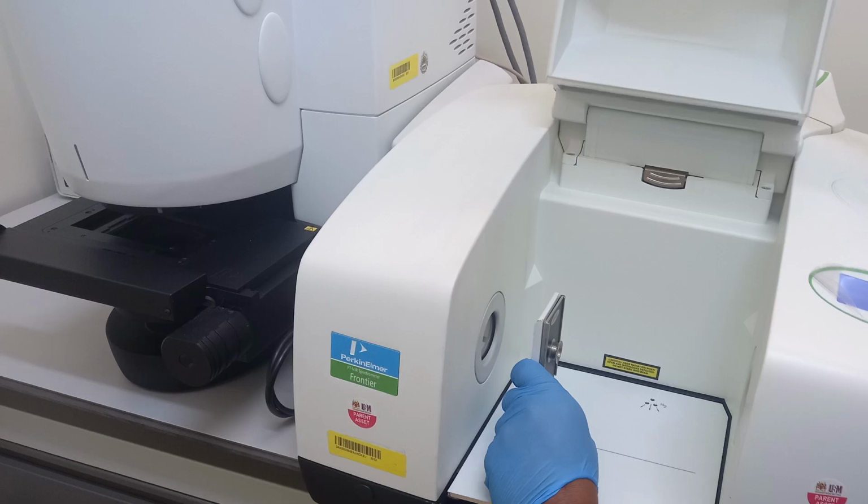When you add less sample with the KBr, the thickness of the pellet would be less. So the sample is thin enough to allow sufficient infrared light to pass through. This is the reason why when you add more sample, the peaks become low.